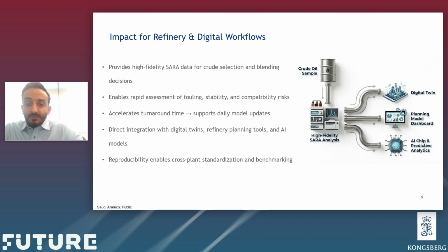The short turnaround time means that instead of waiting days for the SARA data to come back, the data can now support daily and even real-time model updates.